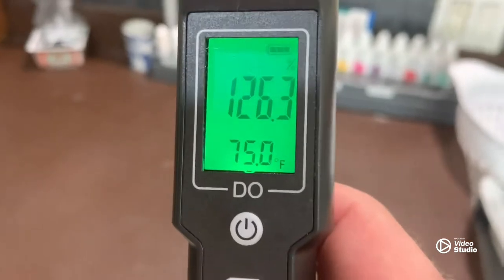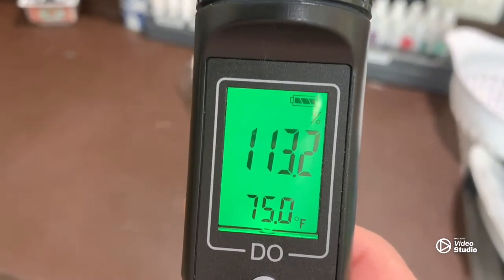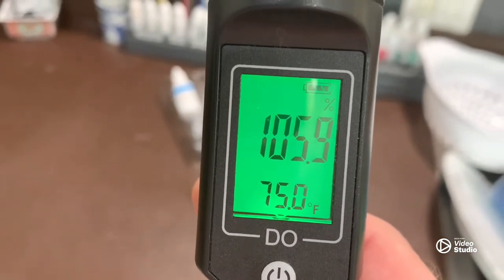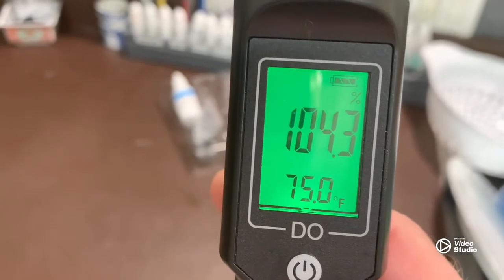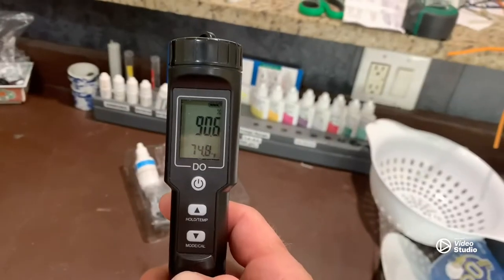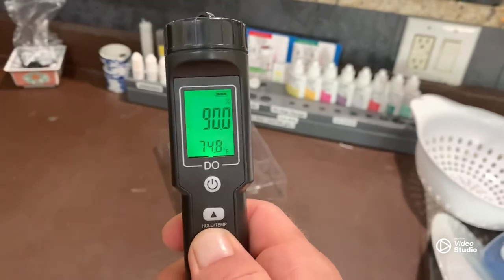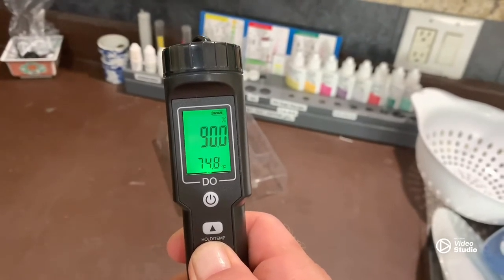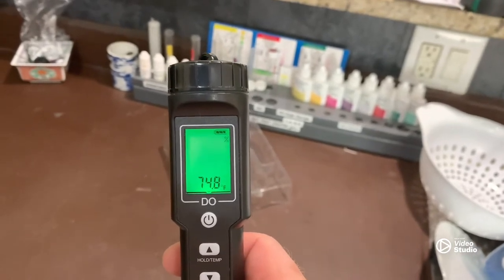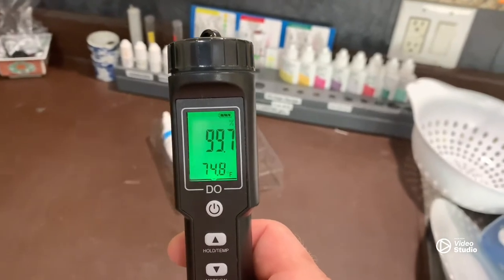Let it sit for a minute and let it settle down to where it needs to go. To calibrate, push and hold the calibrate button for five seconds, let it go, and it'll blink 100 three times — and boom, there it is.